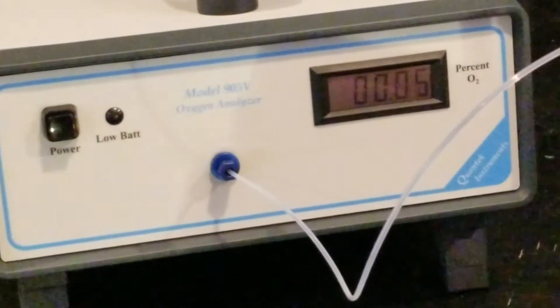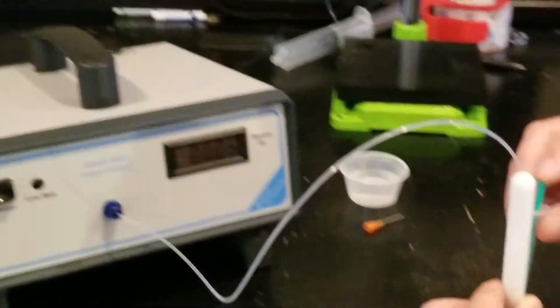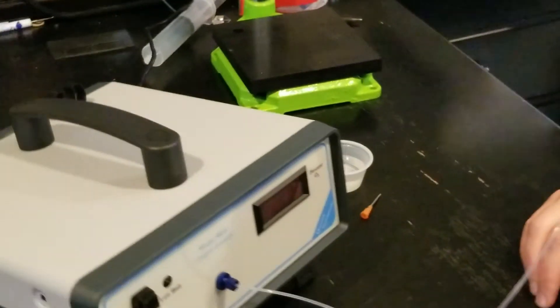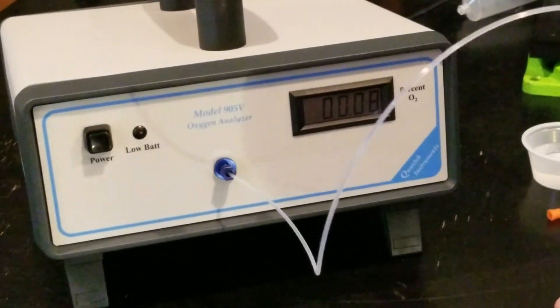This vial is actually almost perfectly flushed. It's going down to 0.05% oxygen and I've almost got a full cc of water injected in here, and it's not going down anymore. So we're going to call this 0.06%. That's it.